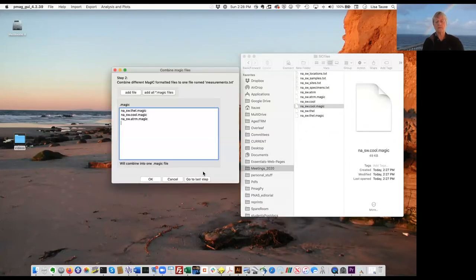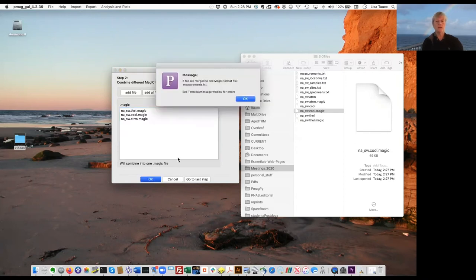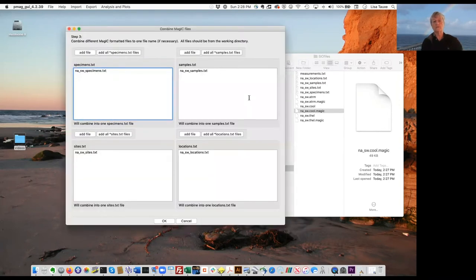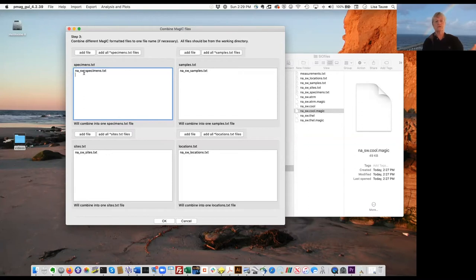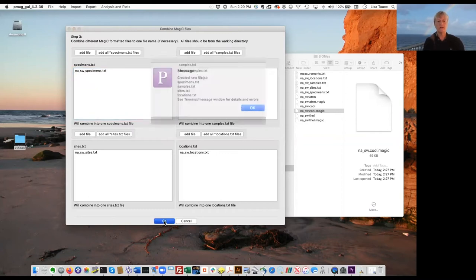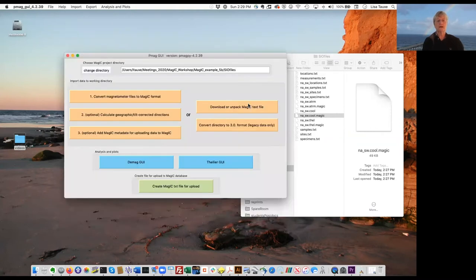Now we can go to the next step, which is to combine all three files into a single measurements table. That will combine these three into a single measurements table. I'll also do the same for the specimen, sample, sites, and locations tables. It searched through and found all the specimen, sample, and sites tables and combined them. In this case there's only one for each table, so it basically copies NA_SW_specimens to something called specimens.txt, which is the standard name required for MAGIC.